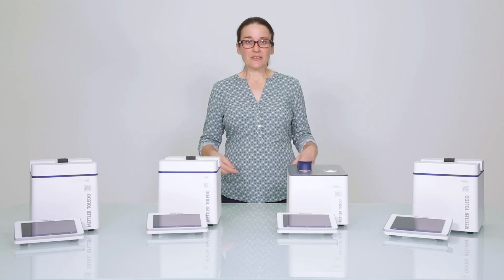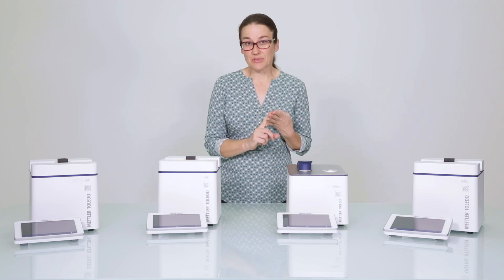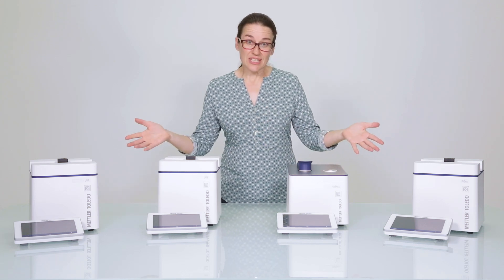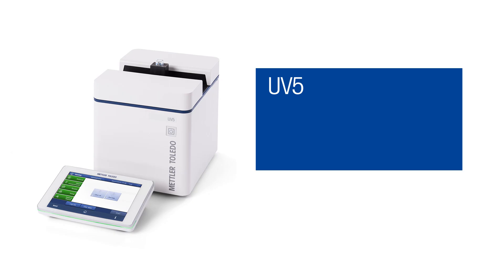All our instruments are fast, accurate, reliable, and simple to use, and as you can see, they all have a really small footprint. Our UV5 offers one-click easy operation, a variety of direct measurement types, and a full spectrum scan in just one second.